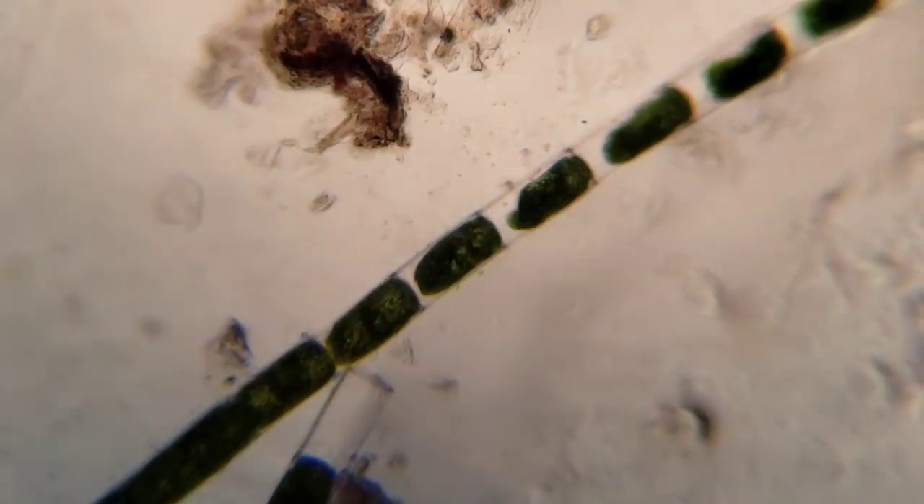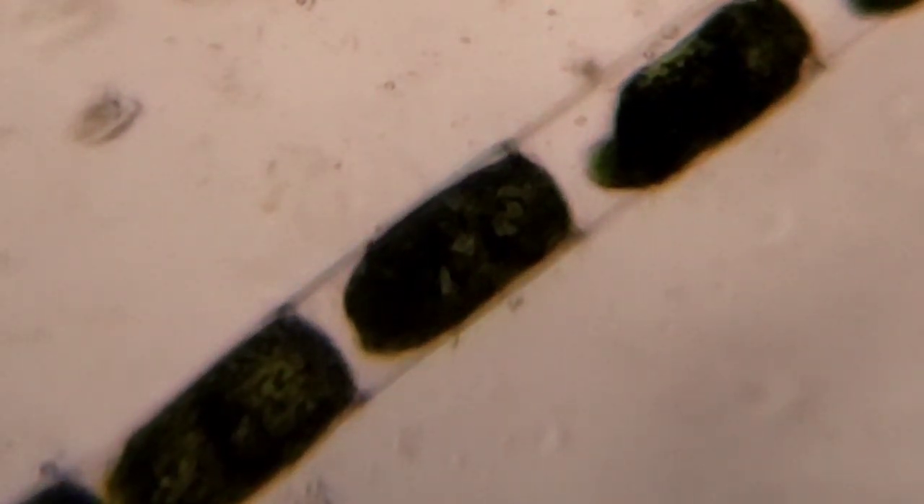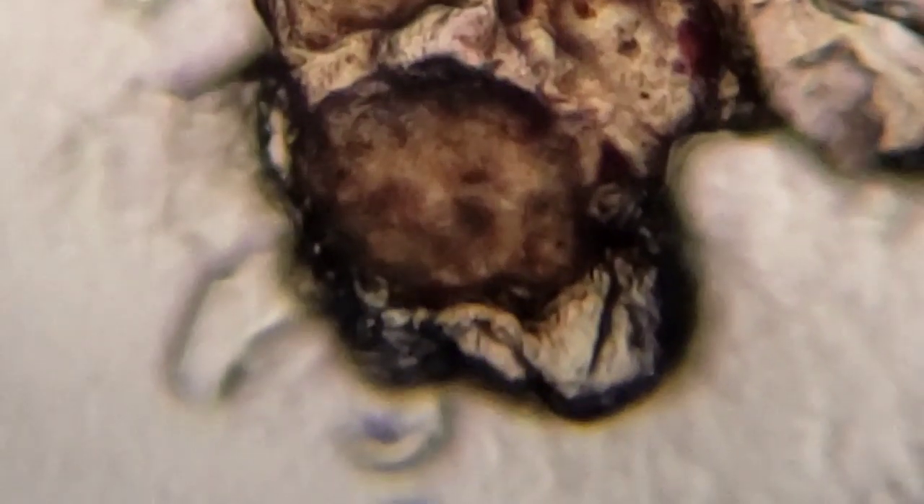You can also see the very tiny single-cell organisms which we cannot unfortunately zoom into on this setup — they just look like little dots moving around, which are probably protists or something along those lines. They would be much smaller than a human sperm cell, which is one of the smaller cells humans have. It's kind of interesting that for humans the sperm cell or gamete is the smallest, and then the egg is one of the largest — kind of an interesting little tidbit there.